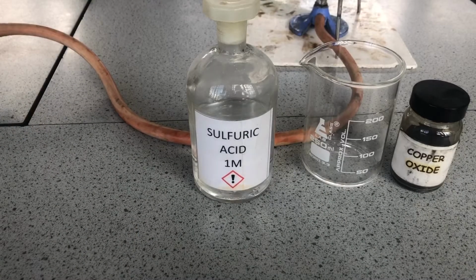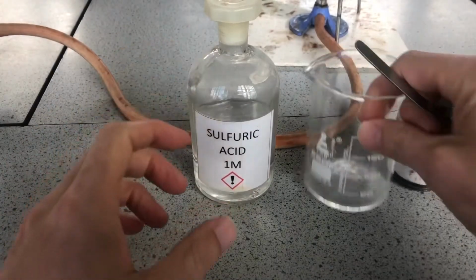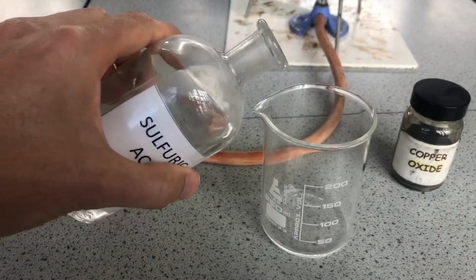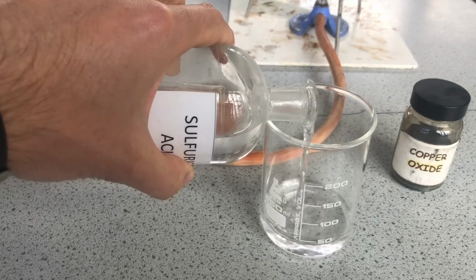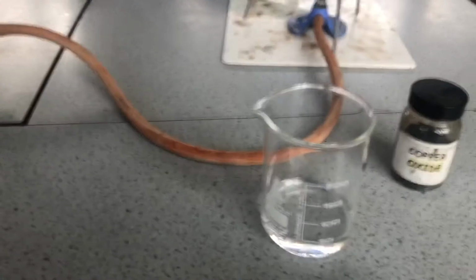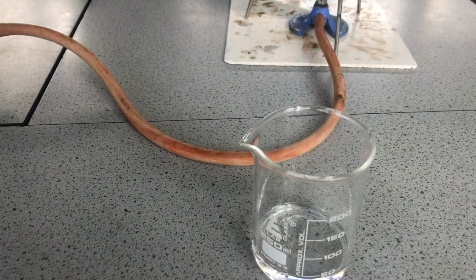So I've got my sulfuric acid here and my copper oxide, and we're going to react these. Now, it really doesn't matter. We're not doing this in a quantitative way, so it doesn't matter too much how much sulfuric acid we use, but I'm just going to put a little bit in the bottom there. If we don't use everything, it doesn't matter. We're just trying to make some crystals, not an exact quantity.